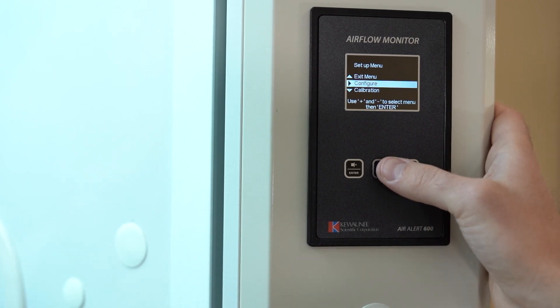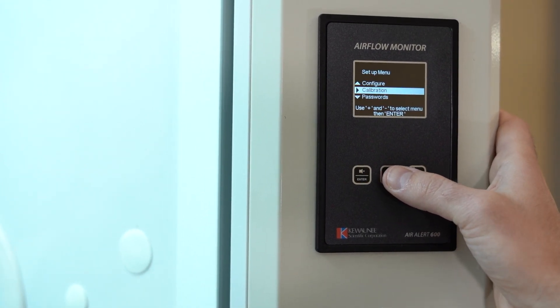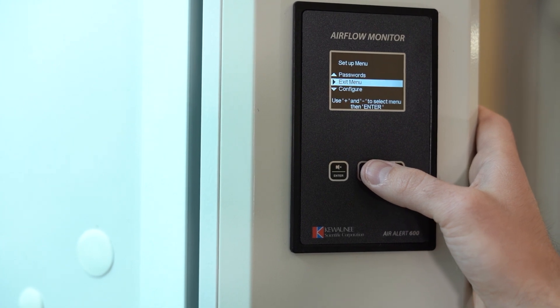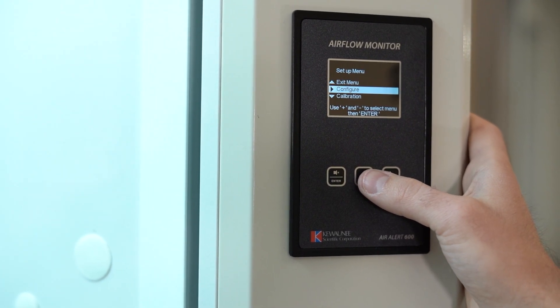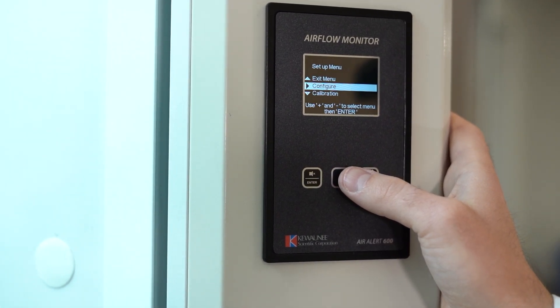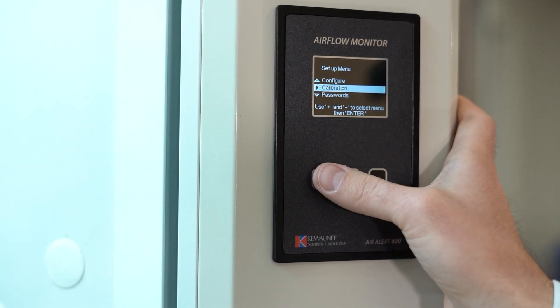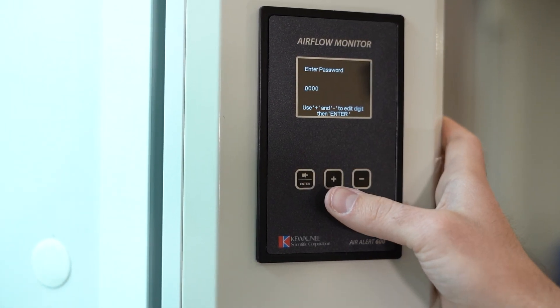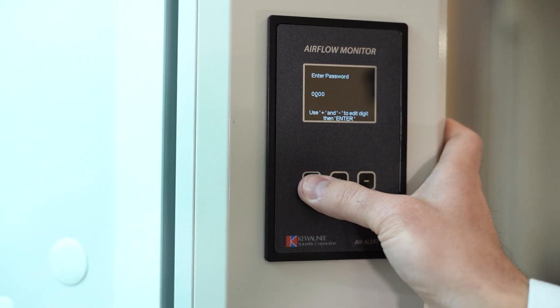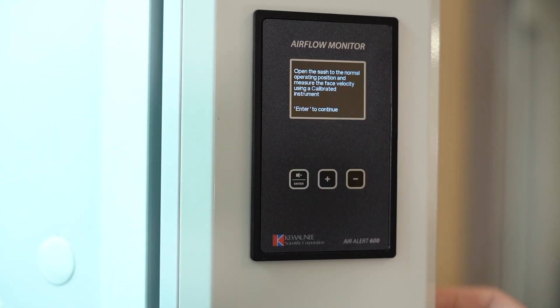The following steps will explain how to calibrate the airflow monitor using a thermal anemometer. From the main menu, enter the setup menu, then calibration. The default password is 0000. The screen will walk you through the steps.